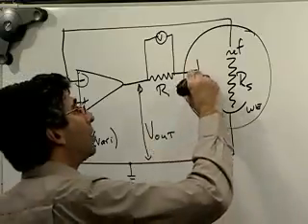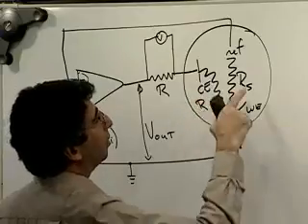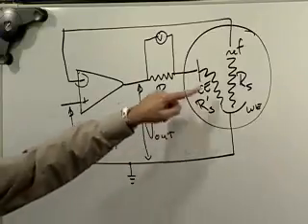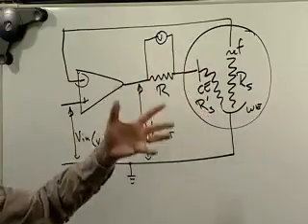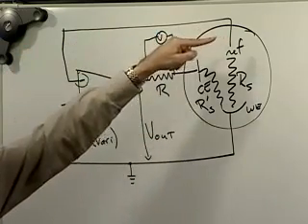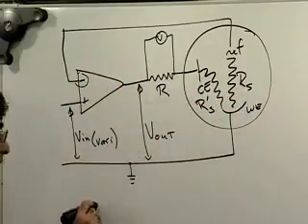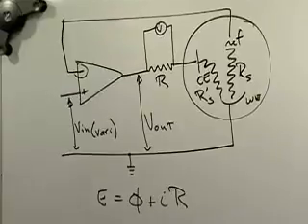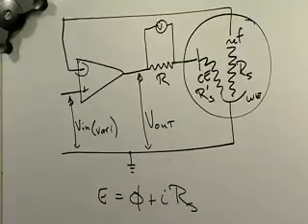And you could think of a second resistance between the working electrode and the counter electrode. Now, this resistance we're stuck with, that is, our current is going to go through that, so R prime times I does have some value, but that's okay because we do not measure our voltage there. We're measuring it over here. However, our voltage measurement in this circuit is only as good as our compliance with this equation. So if RS, not RS prime, but if RS becomes large, that can be an issue.